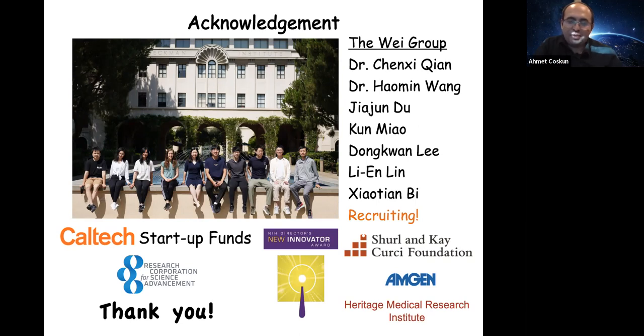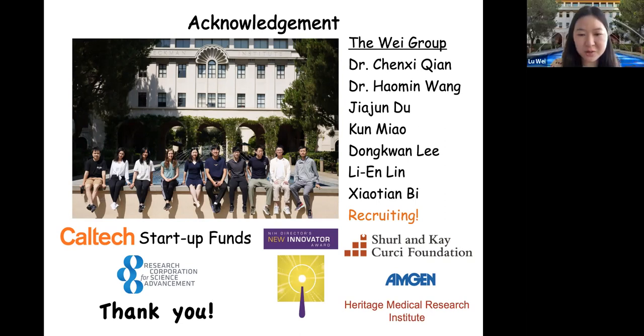Great. Thank you. We have also another question in the chat. Is there any limit to how long and how often you can image live cells over time, such as photo damage or other toxic effects? Thanks a lot for the question.